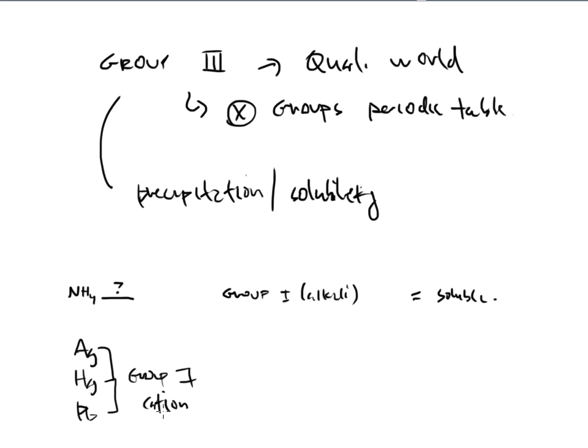And the reason that they are in a group is because they behave unlike anything else when it concerns this solubility rule. Silver, mercury, and lead precipitate out the same way, and they all behave very commonly, except for everything else on the periodic chart, meaning that no other atom on the chart does what silver, mercury, and lead do with chloride, bromide, and iodide.